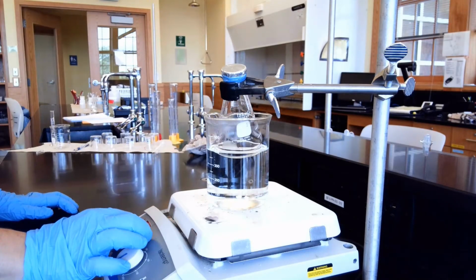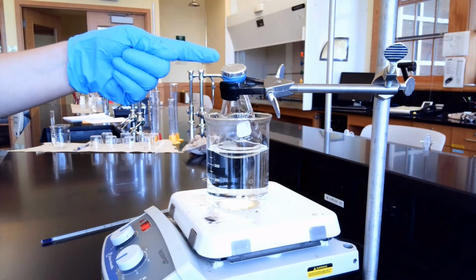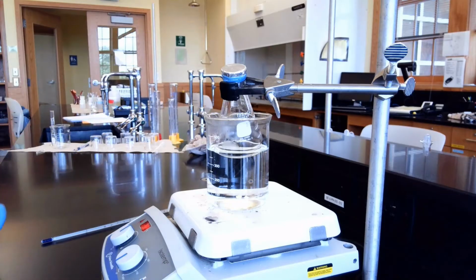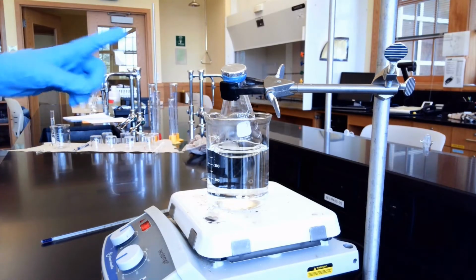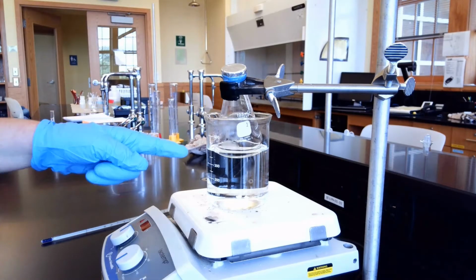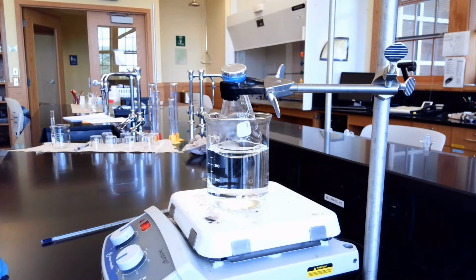Let it boil until we see no more steam coming from here and no more liquid in the bottom. And then we'll heat it after we see no more steam coming out of the hole. We will heat for another 5 minutes. We'll take the temperature of the water and we'll get the barometric pressure of what the room is at today.